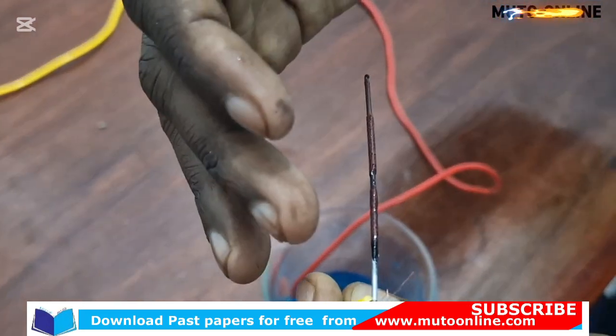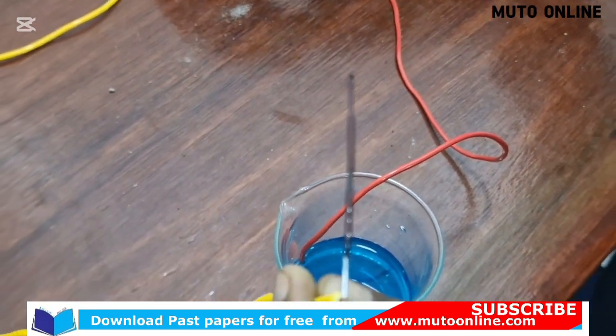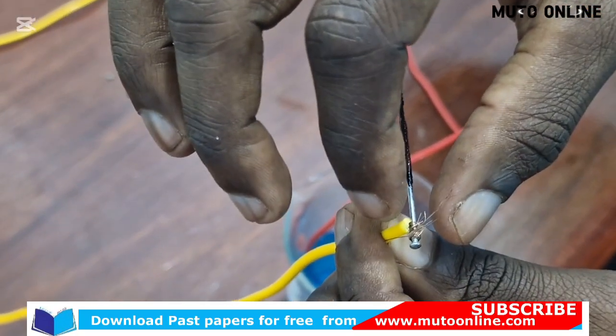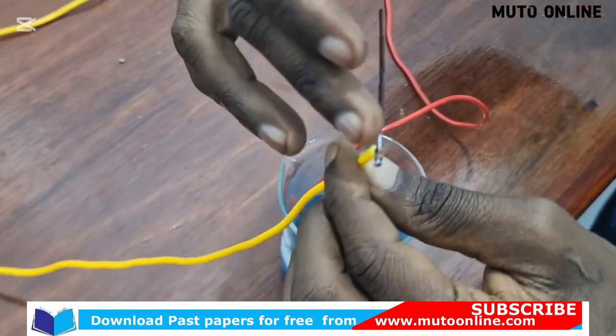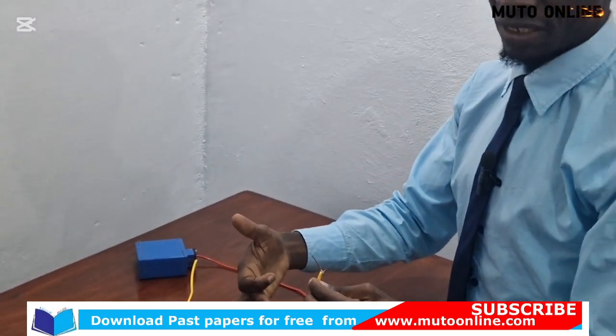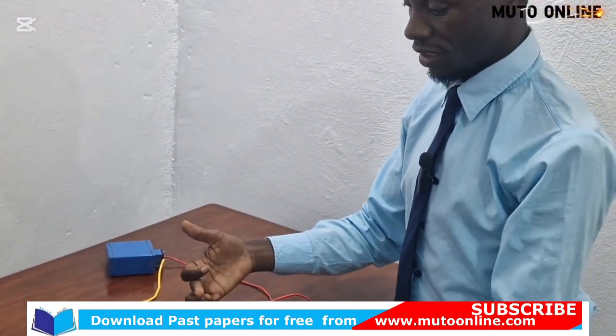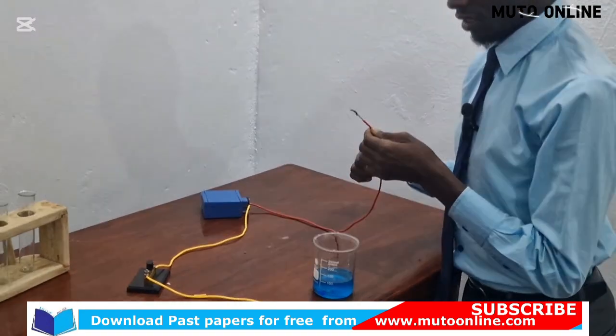So it is connected to the negative terminal like we saw. So there is discharge of the copper ions from the solution, forming the copper metal that is deposited around the pin.